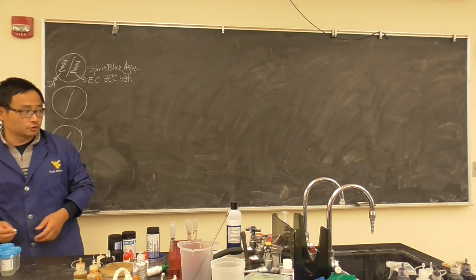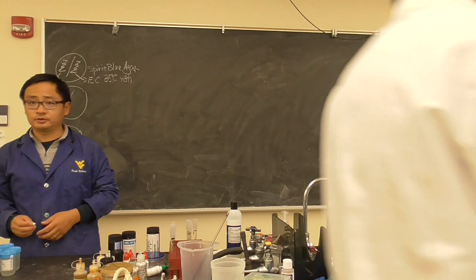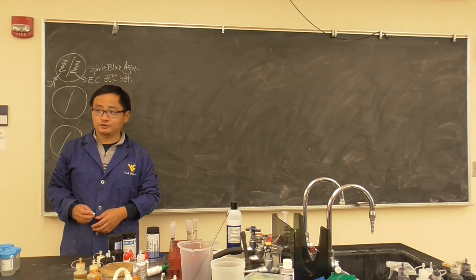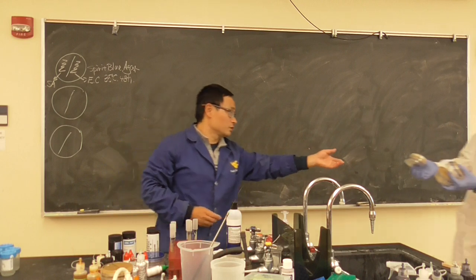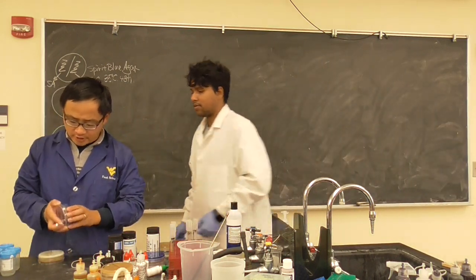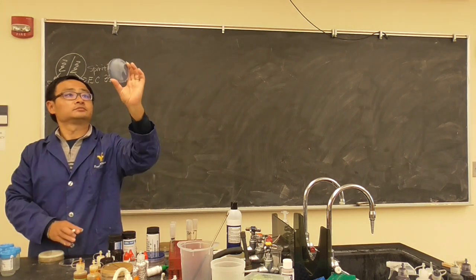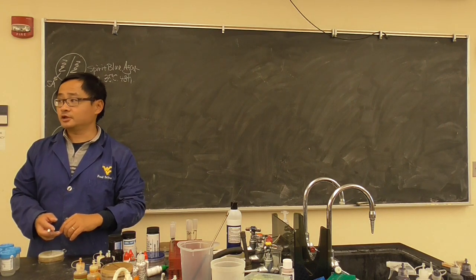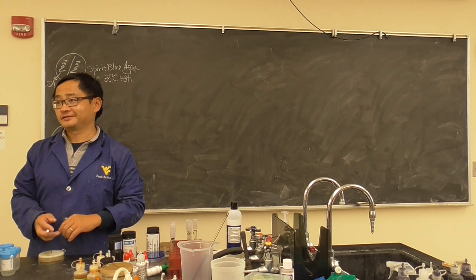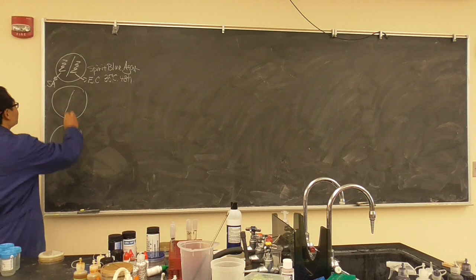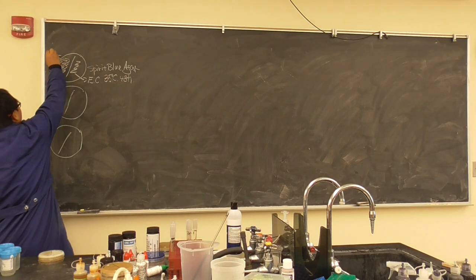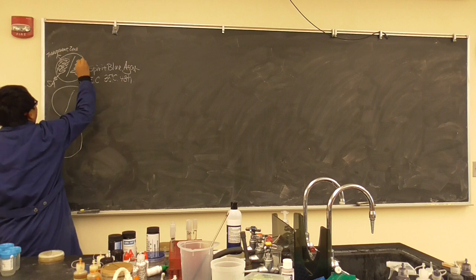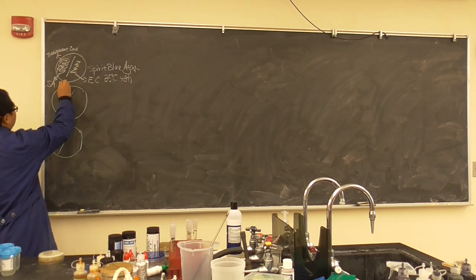Let me see some of the student samples. It seems like both sides look the same. So the results look like the Staphylococcus aureus side should have a transparent zone, and the E. coli side should not — because the spirit blue agar has lipase activity. So the transparent zone should be on the Staphylococcus aureus side.